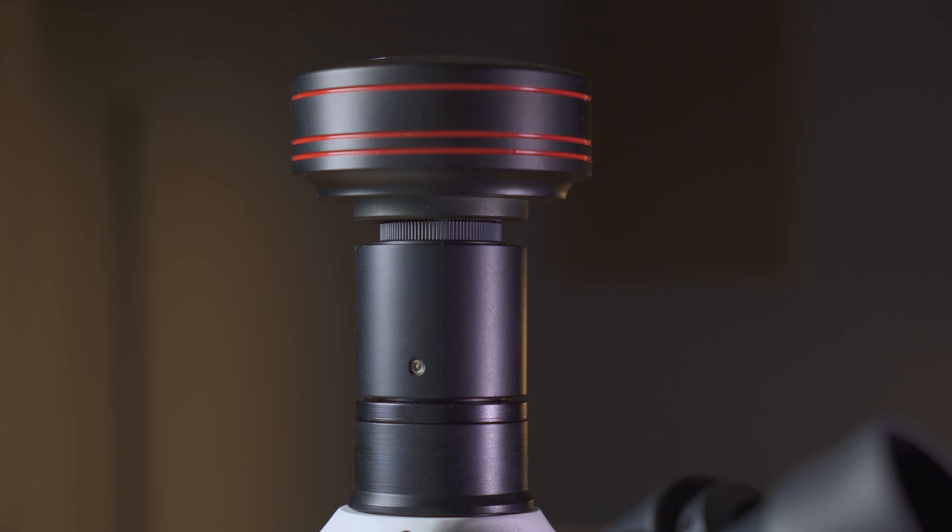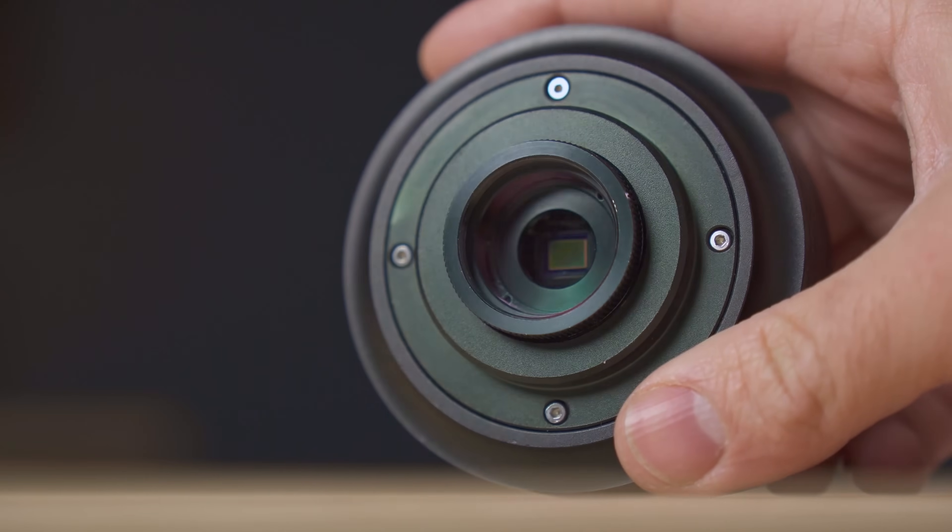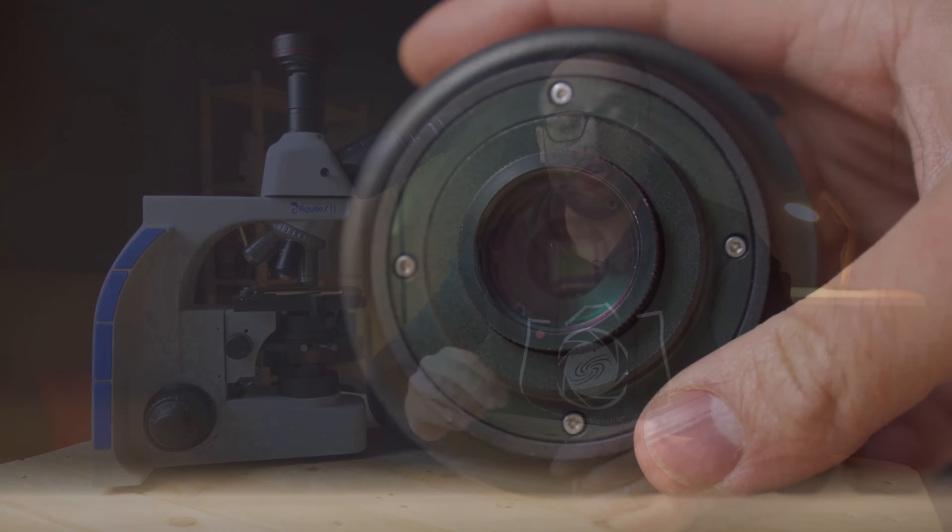The camera placed here is an Axon Aptina V2 with 5 megapixels with a resolution of 2,592 x 1,944 pixels and with a pixel size of 2.2 microns. In reality it's a camera very similar to a webcam and to the cameras used in planetary astrophotography.